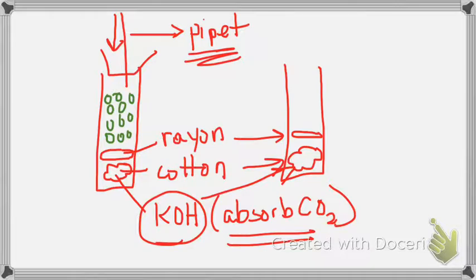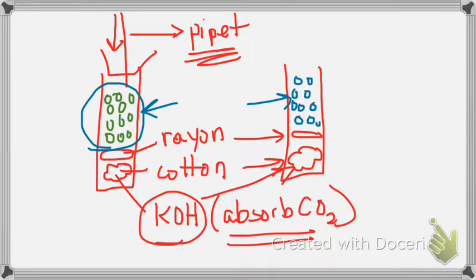So I have these blue circular beads. That's the standard, what we've been using. They are kind of pea-shaped and sort of pea-sized. But you need to make sure that the volume occupied by those glass or plastic beads is equal to the volume occupied by the peas themselves. So the experiment calls for using a known volume. The first thing you'd have to do while you're getting this set up is find out what volume is occupied here.